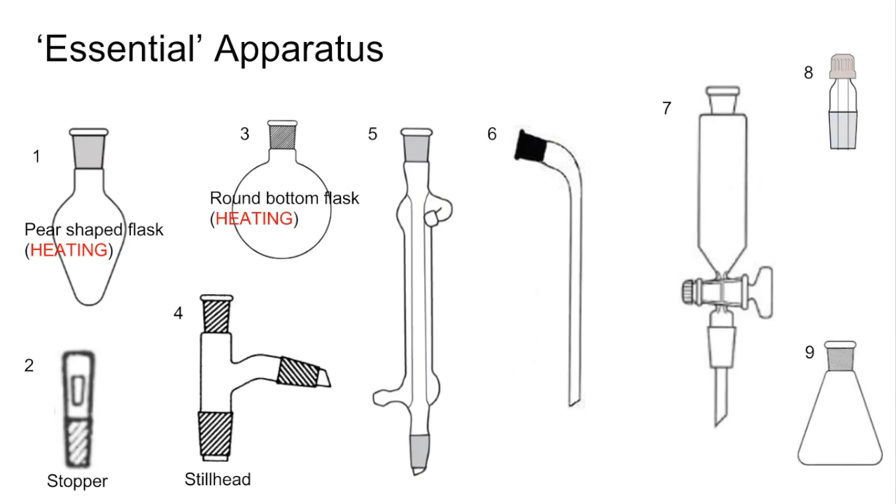Number five is what we call a Liebig condenser. If you want to attach a Liebig condenser to a pear-shaped flask or round-bottom flask in the distillation position, you need to attach a condenser with the flask below. The still head would go in between the flask and the condenser.